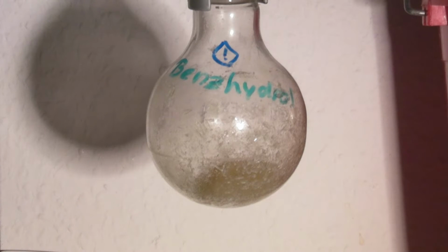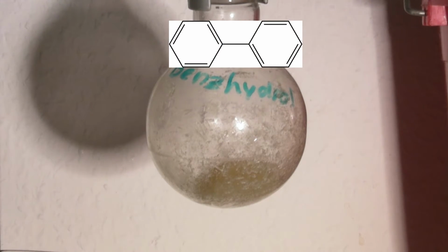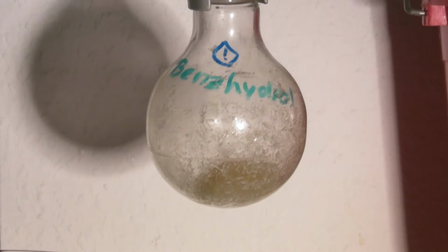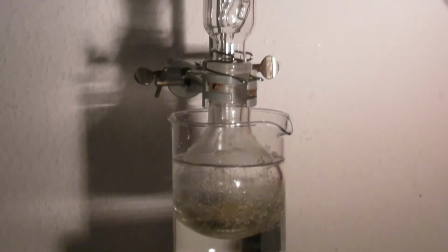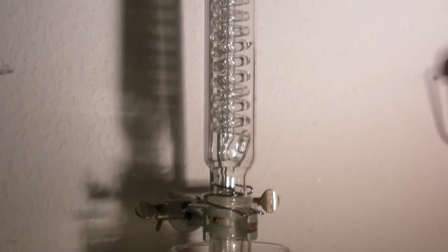When benzhydrol is prepared via a Grignard reaction, it is mainly contaminated with biphenyl and an oily substance. That's why it has to be recrystallized. The setup is a hot plate with a water bath and a stirring bar. On top of the round bottom flask, a reflux condenser is added.